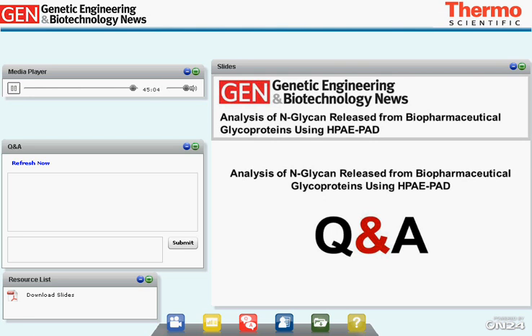For example, one glycan motif that we have to analyze via mass spectrometry is the O-acetylation, as O-acetylated residues will get lost at the high pH we are using for HPAE-PAD analysis. So this glycan motif we have to analyze via electrospray mass spectrometry.